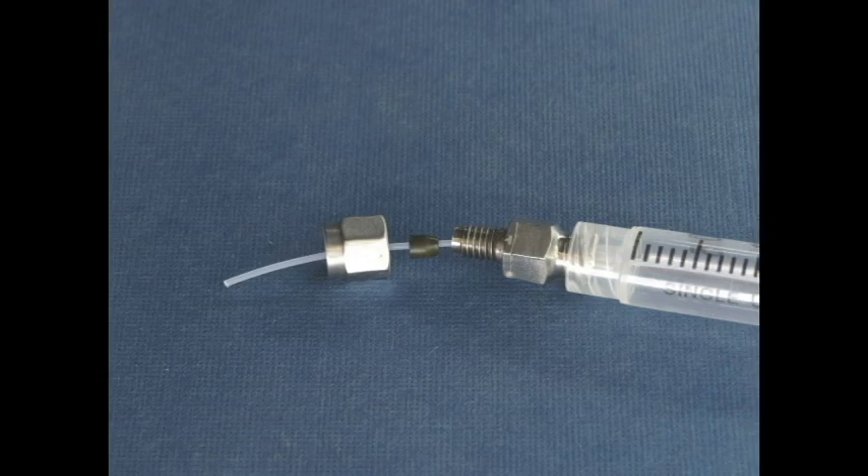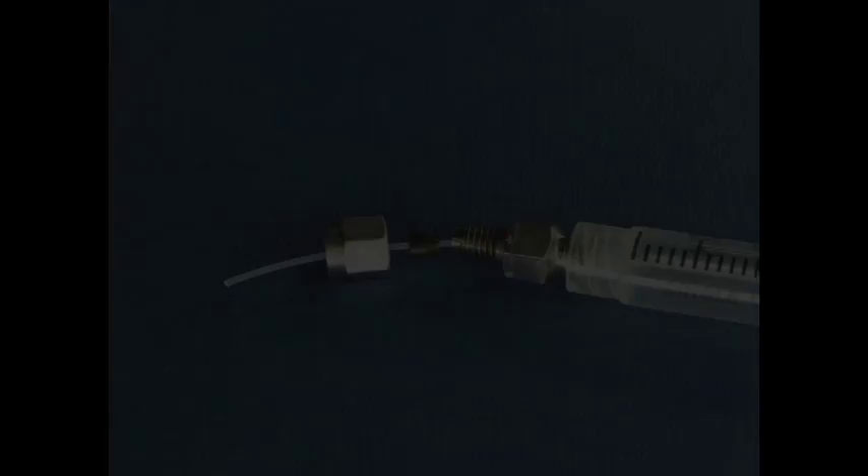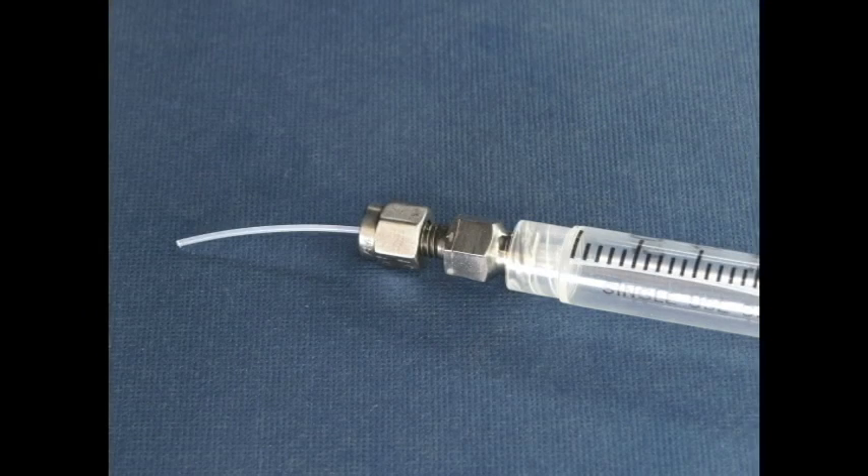Third, we can use our PTFE adapter ferrules with this fitting to connect PTFE tubing. We also make PTFE needles by the same method we showed previously when making custom dispensing needles with hypodermic tubing.